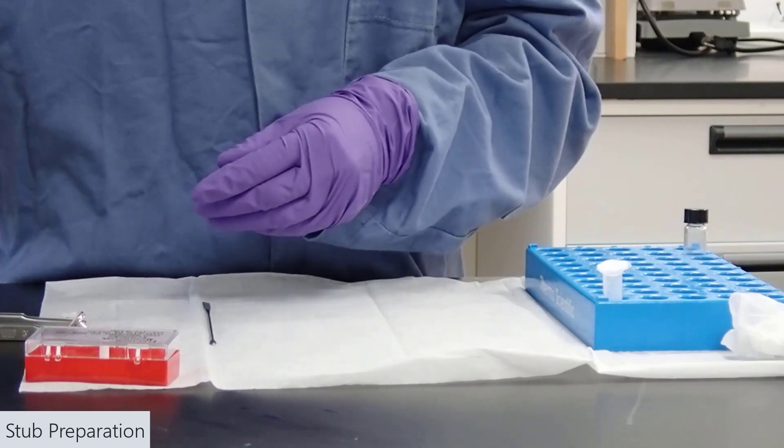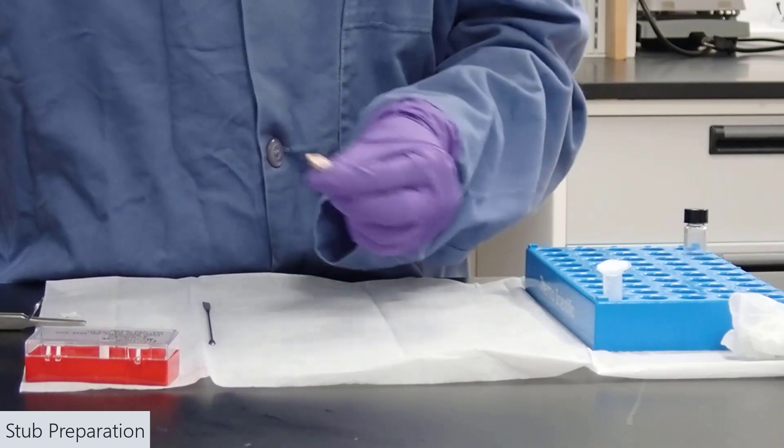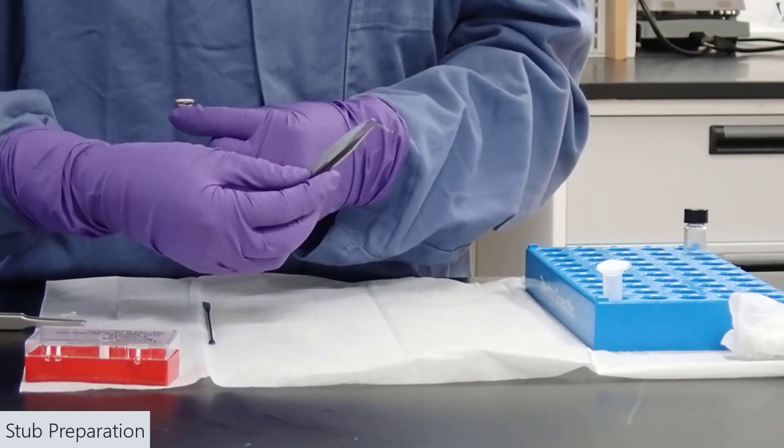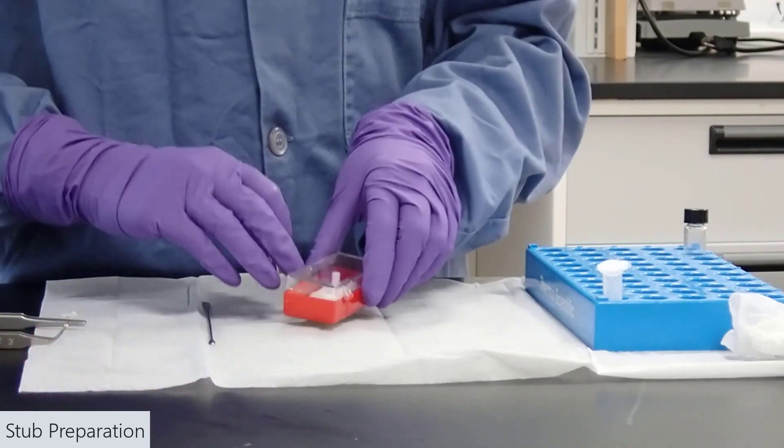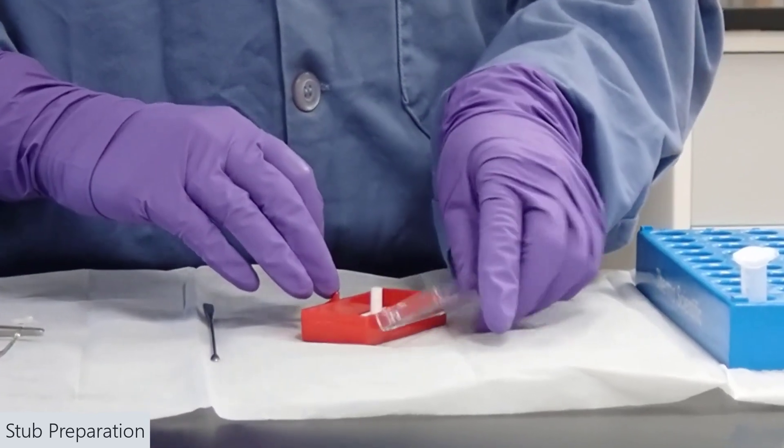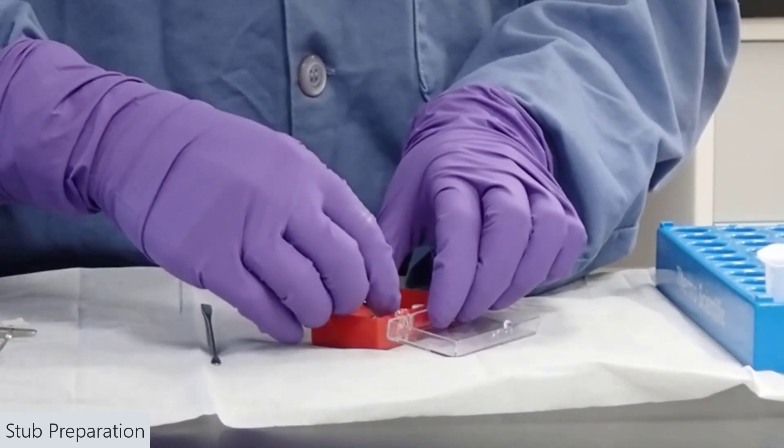Flat tweezers can be helpful. Stub tweezers, an aluminum stub. We'll also need double-sided tape, either copper or carbon.